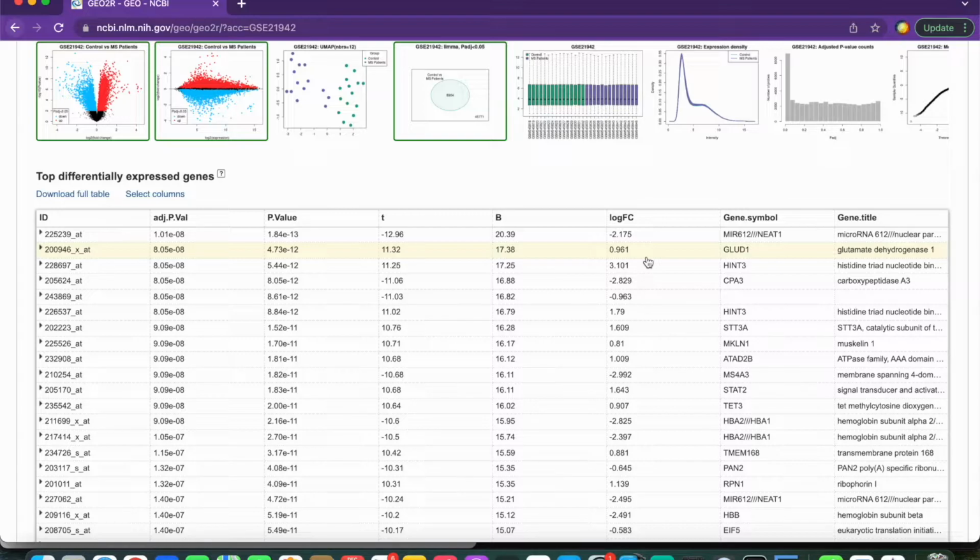Think of this as a court trial. In order to find someone guilty, there's a certain threshold of evidence that is needed to be provided. Fail to meet that threshold, and you will not win the case. In that same way, the p-value either fails to reject the null hypothesis, meaning that there is no difference in gene expression, or it does reject it, meaning that there is. And the lower our p-value, the stronger our court case gets.